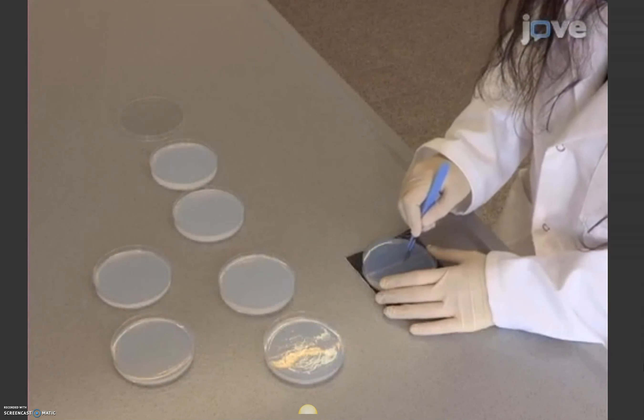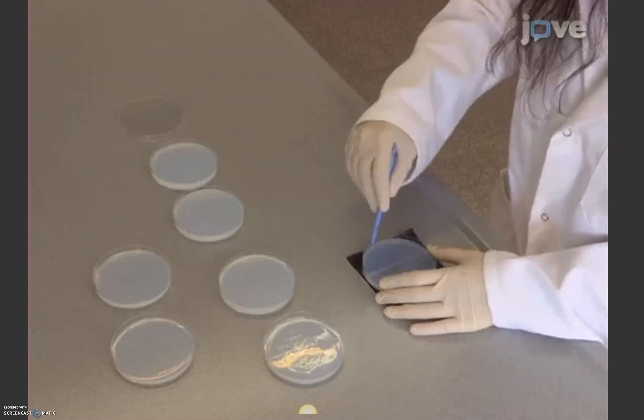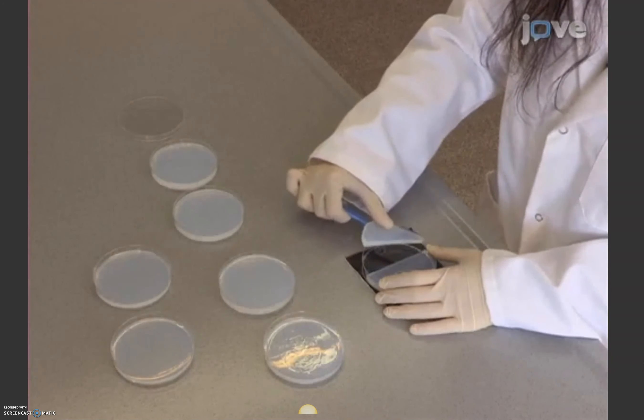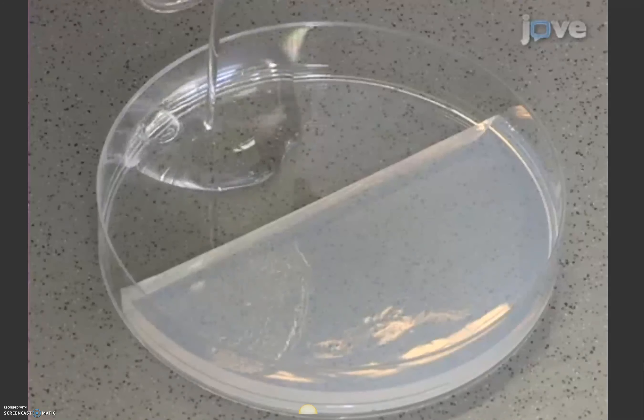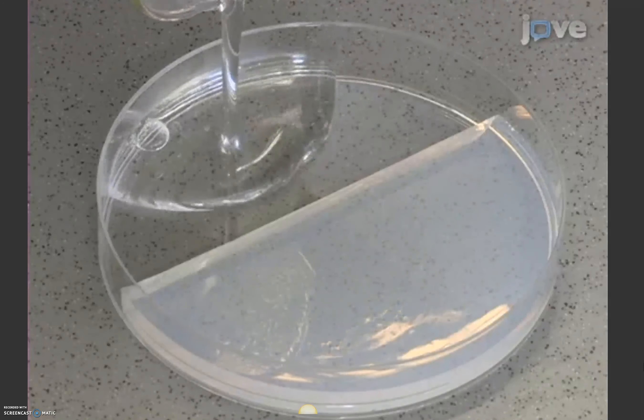To test for naive sugar preference, prepare half-half petri dishes by cutting out half the agarose of a cooled dish and filling the vacant space with molten agarose of the other type.